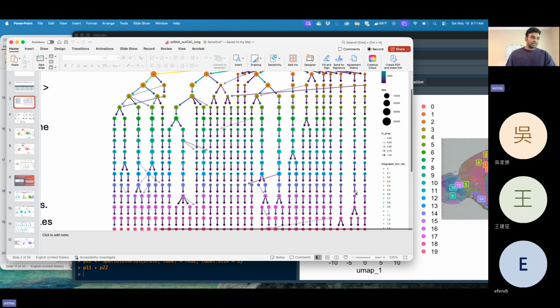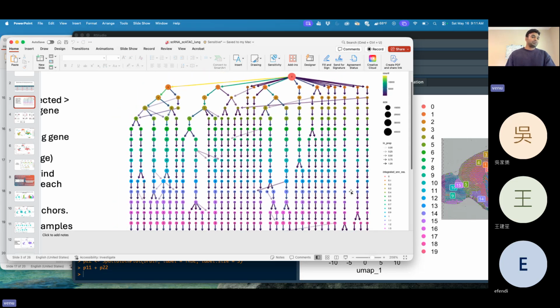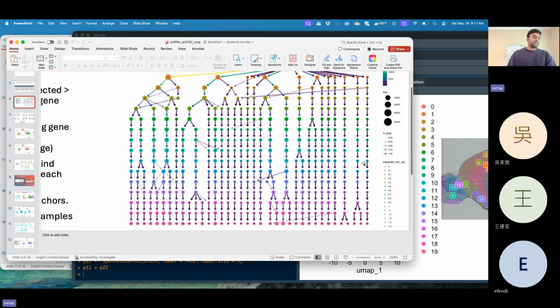So before we run the analysis, we check what is the best number of splits, what is the best resolution, where from here onwards it is constant. There is no change, so we can consider that as optimum. So even 0.7, almost all of these are not changing much.